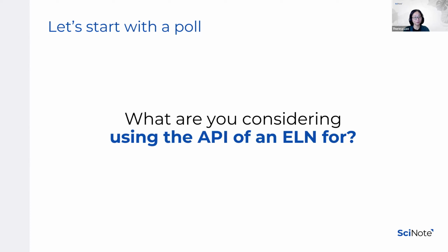You could be considering using this for connecting to other software, platforms, systems, think other software like LIMS or ERP or CRM, other databases, etc. You could also be thinking about migrating data from one system to another. You could be considering connecting with equipment that collect data, like flow cytometry systems or lab balances, which we've seen. It could also be for workflow automation, generating special reports or whatnot. There are also other possibilities.